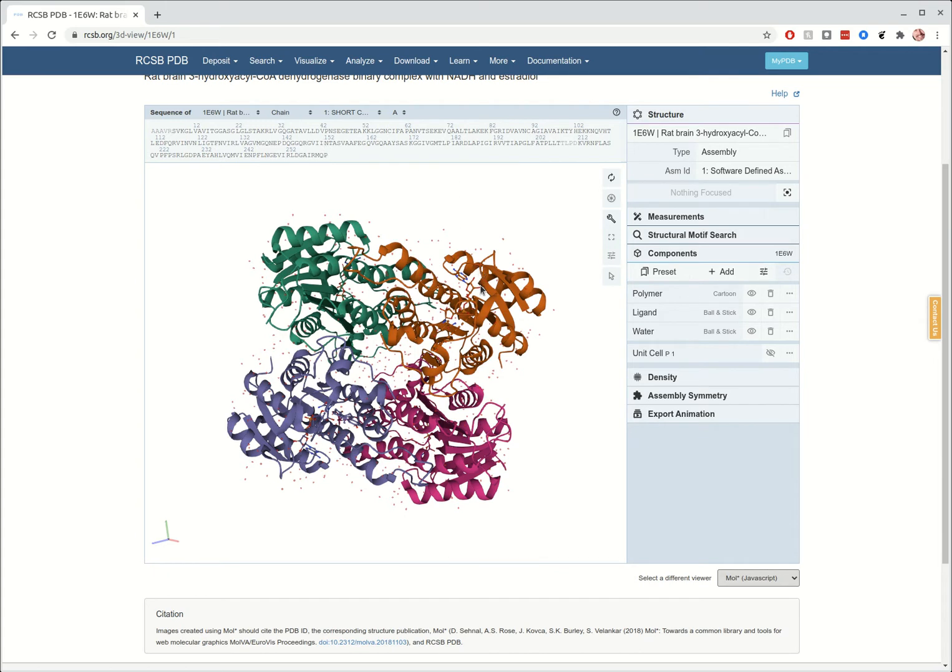Then we talked about quaternary structure. We have the 4 subunits down here, A, B, C, D, and when you highlight your cursor on one, it tells you if you're on part A, B, the pink one is D, and this blue purple one is C.